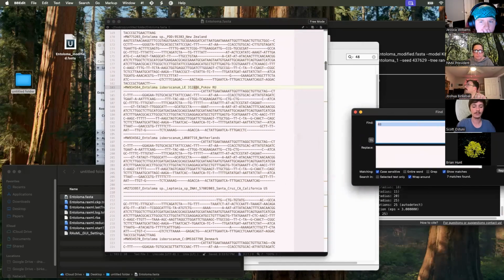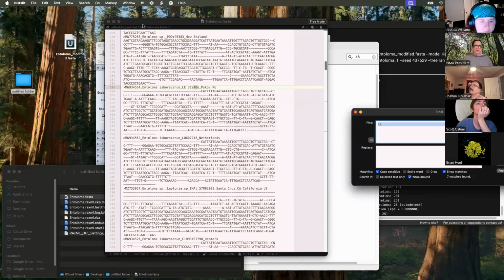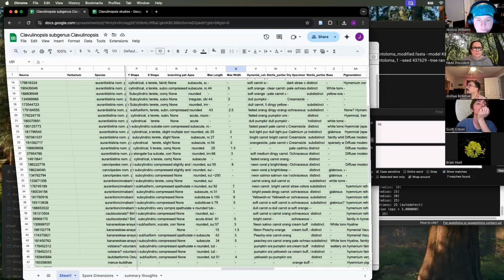Wait, where'd that go? Thought it was 48. Let me double check. Yeah, CA48 should be one of them.